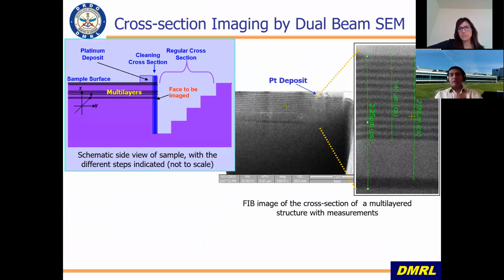So now coming to the first part, as in using the dual beam, how this can be done. Using the dual beam, we can very easily see the cross section of a heterostructure. Because of the typical geometry of the dual beam, this is from the one that was in my earlier lab, and here at INL we also have a high-end Helios system.